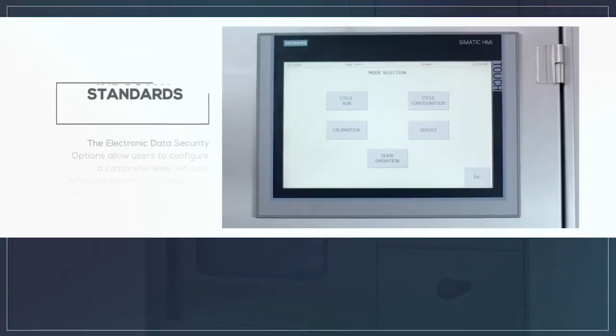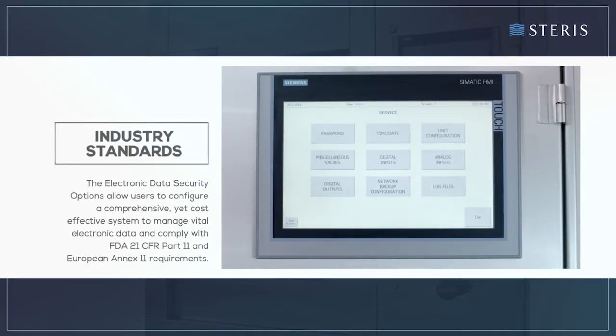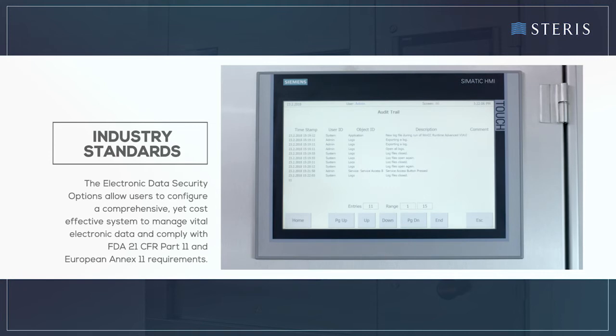The electronic data security options allow users to configure a comprehensive yet cost-effective system to manage vital electronic data and comply with FDA 21 CFR Part 11 and European Annex 11 requirements.